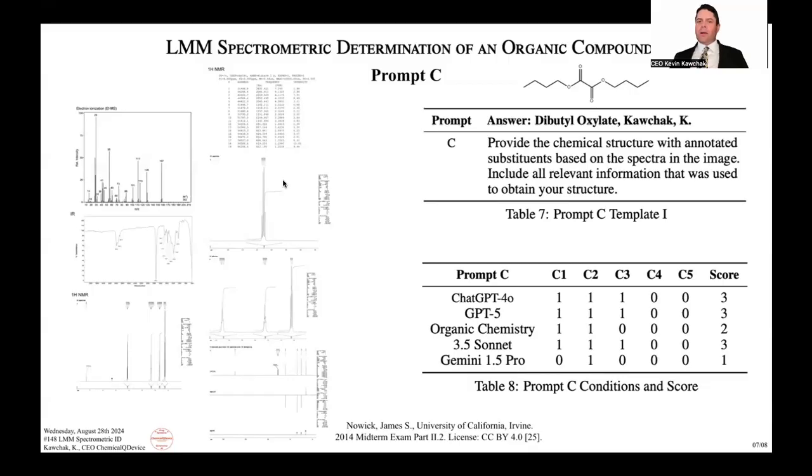This is a doublet of doublets coming off of the next CH2 down, away from the oxygen. And the professor actually says, calculate your J values too. So that was tricky about this, beyond just the symmetry. And I knew I didn't have any chloros or dibromos or anything, because the molecular weight didn't have those splitting diagnostic peaks coming off of those types of atoms.